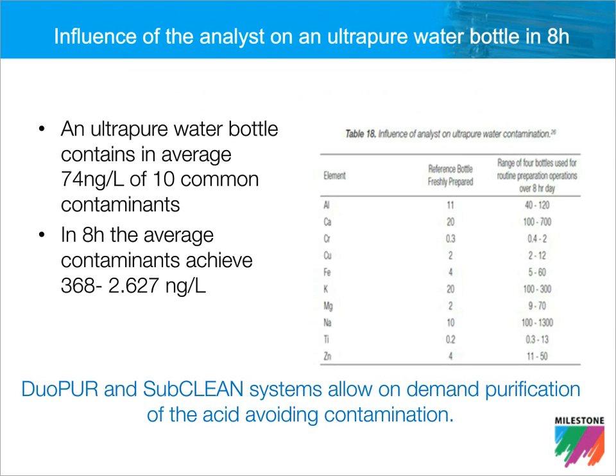What's nice when we are purchasing ultra-pure acid is that we get a certificate with it, correct? We get a certificate that guarantees that the contamination within this bottle of acid is at or below these limits. The problem is that as soon as that bottle is cracked open, that certificate is null and void. It no longer applies.